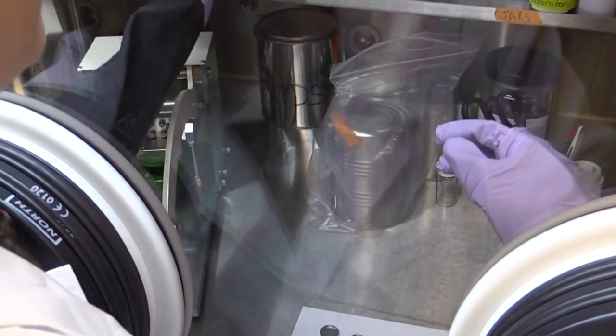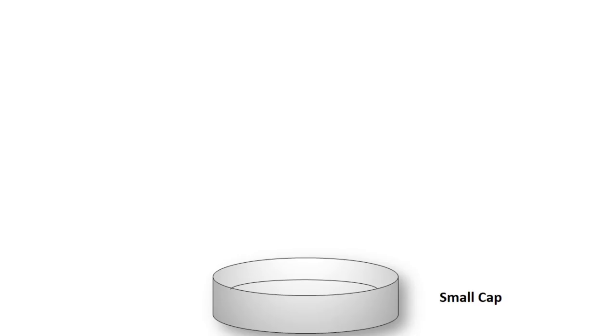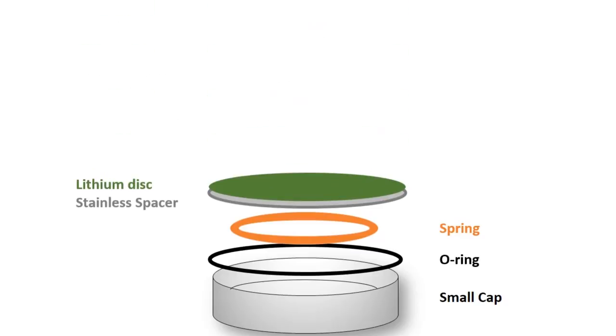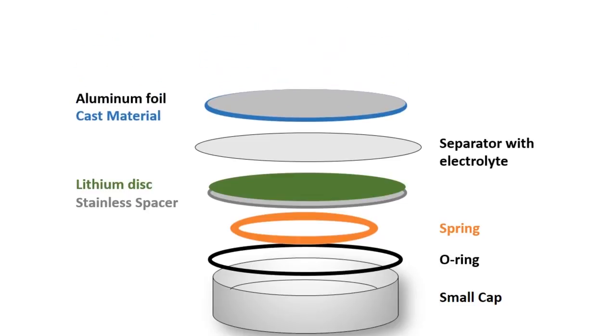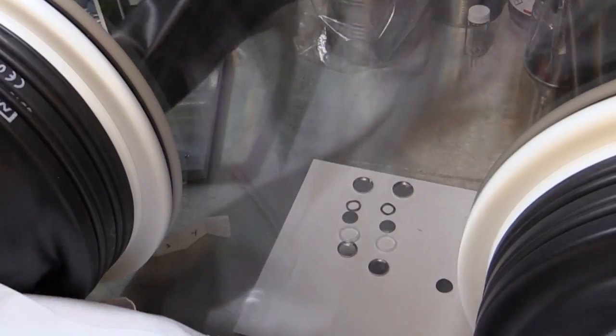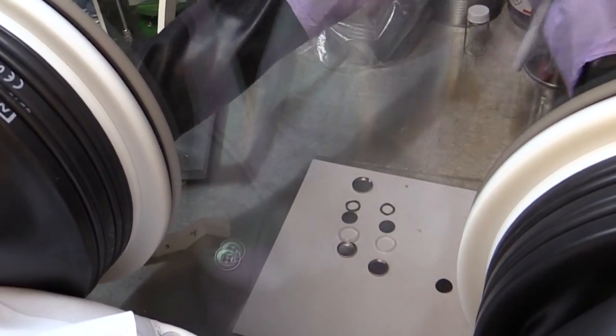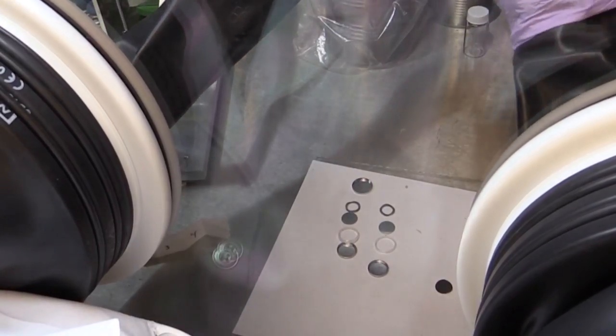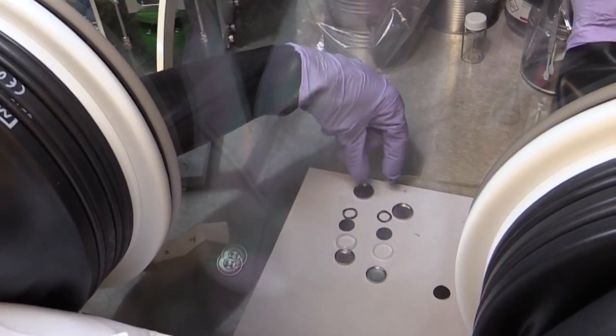In order to assemble several of them in a quick fashion, it's easier to line up all the parts and then assemble each step of each one of them as you go. So first there will be the small cap. We'll press the o-ring on it. It should click. Then we'll put the spring in there. The stainless steel spacer with the lithium attached on top. Then we'll drop the electrolyte. Put the separator. And then we can see our aluminum foil with our material cast on top. And the large cap on top. And you'll need to label the caps with the numbers of the coin cell. So if this one will be electrode number one, and this one will be electrode number two.